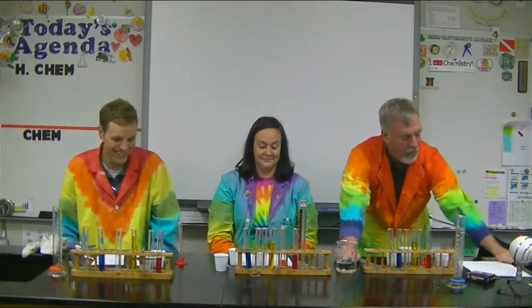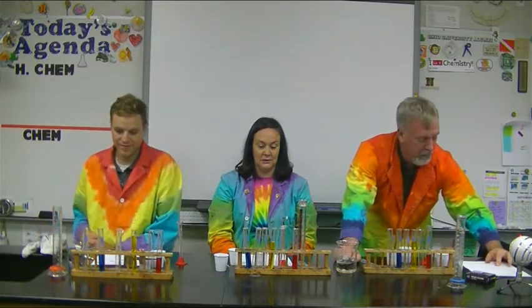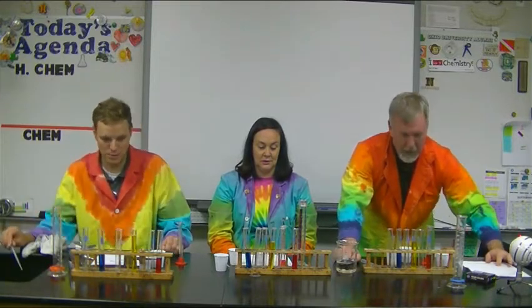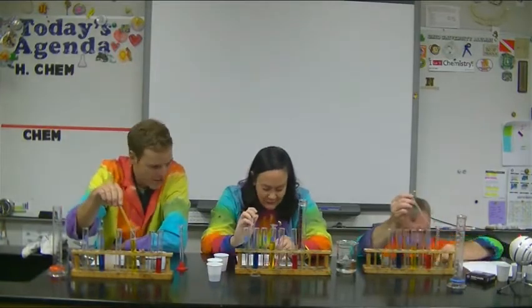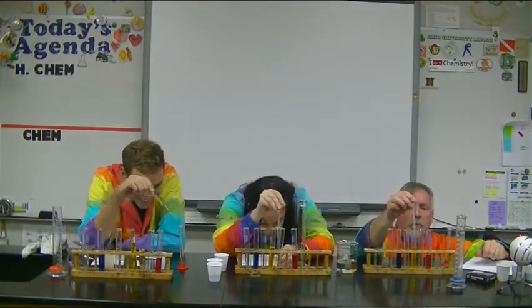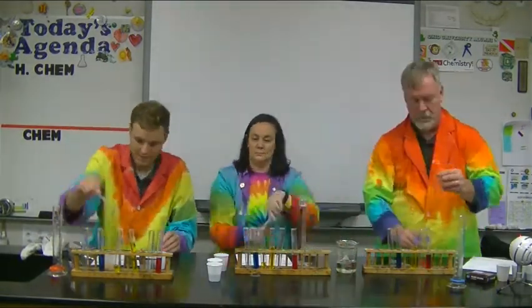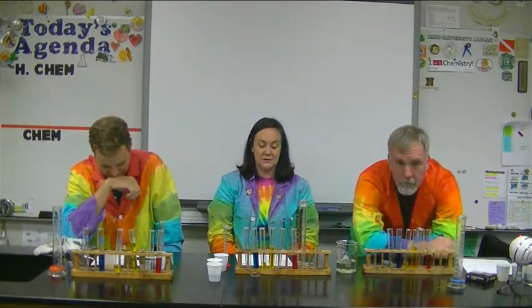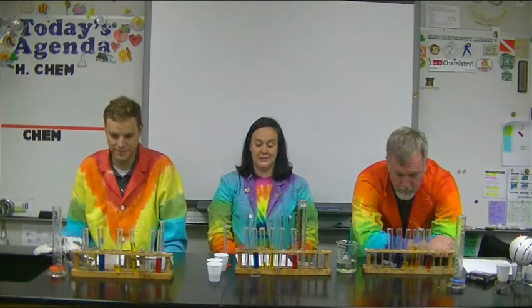Step number 7, transfer 5 milliliters of the solution in test tube C to test tube D. 5 milliliters. Test tube transfer. Are we done with the cups? Step 8, transfer 6 milliliters of solution in test tube E to test tube D, mix by gently flicking the test tube.